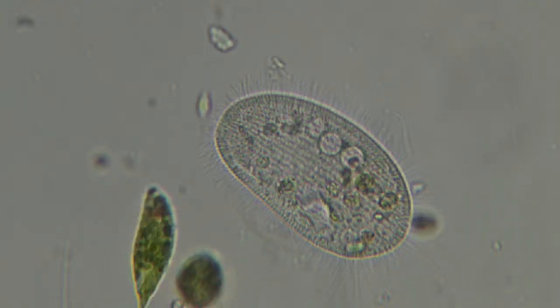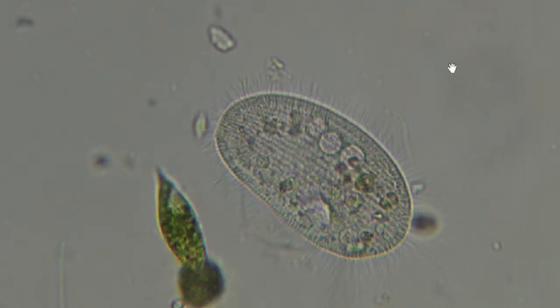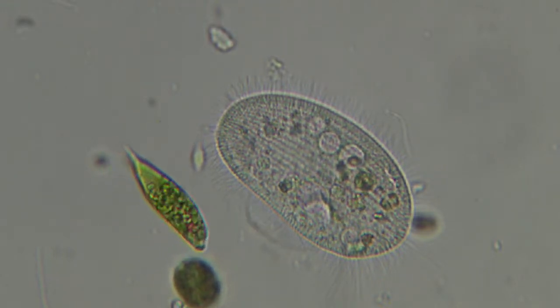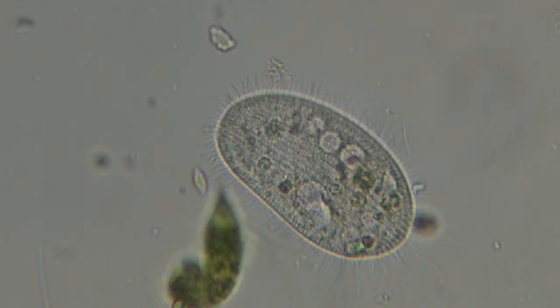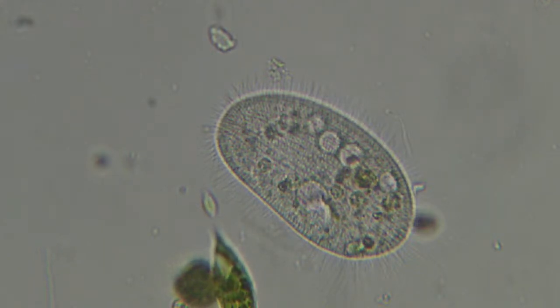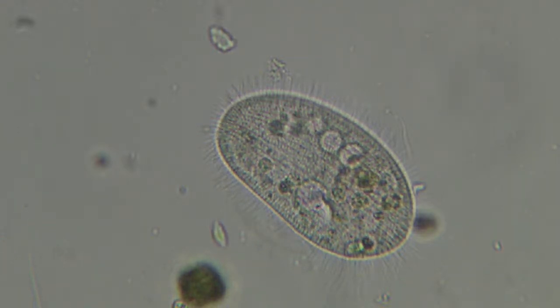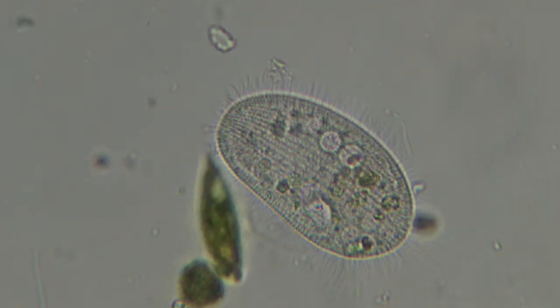There's the contractile vacuole. If you look right here, there's one kind of opening and closing like it's pumping. That's the contractile vacuole, keeping the water balance in the cell. And it's filling up. There it goes. Almost looks like a really slow heartbeat, but it's an osmotic regulatory organ for the cell.